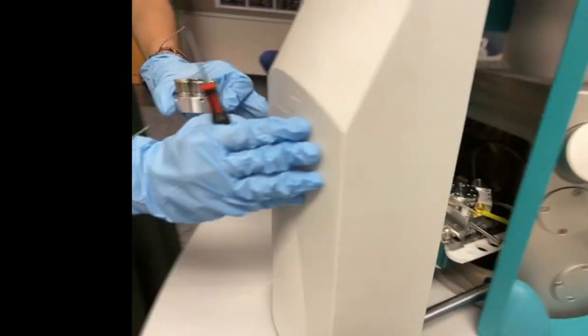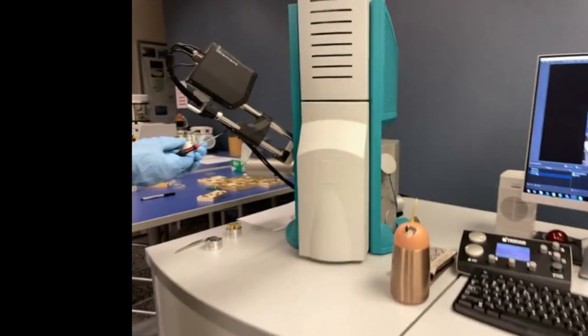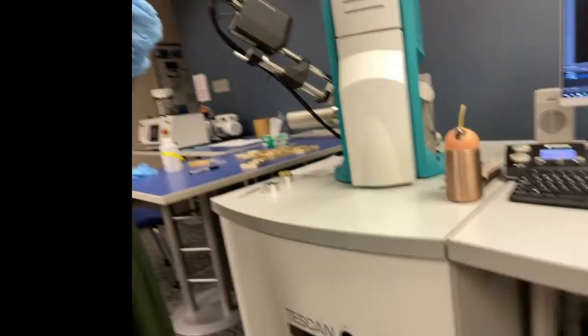She just basically undid a little bolt. Yeah, you can close it. So this is the SEM itself. This is Laura herself. This is the entire system.